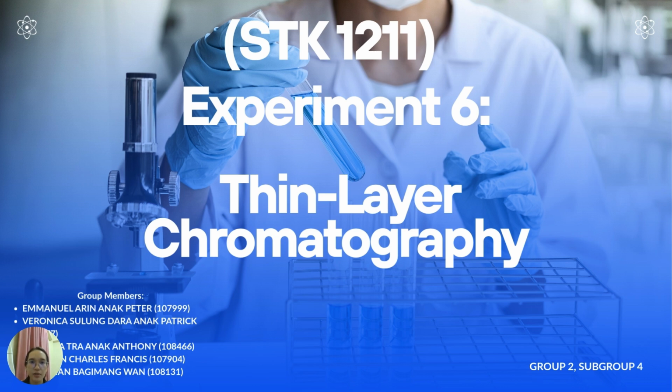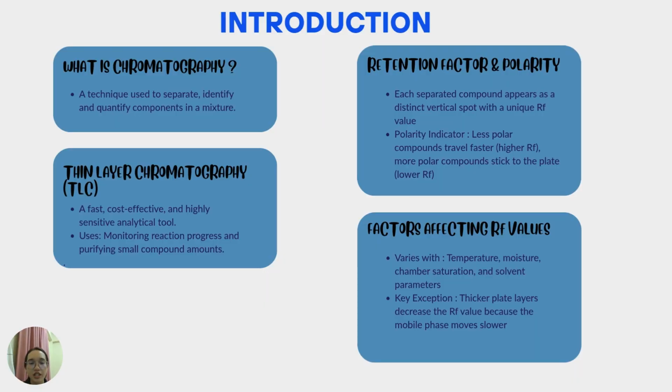Hi, today we will be presenting Experiment 6, thin layer chromatography, and I will take part in the introduction and objectives. So first, the introduction. What is chromatography? Chromatography is a technique used to separate, identify, and quantify components in a mixture. Thin layer chromatography (TLC) is a fast, cost-effective, and highly sensitive analytical tool used for monitoring reaction progress and purifying small compound amounts.